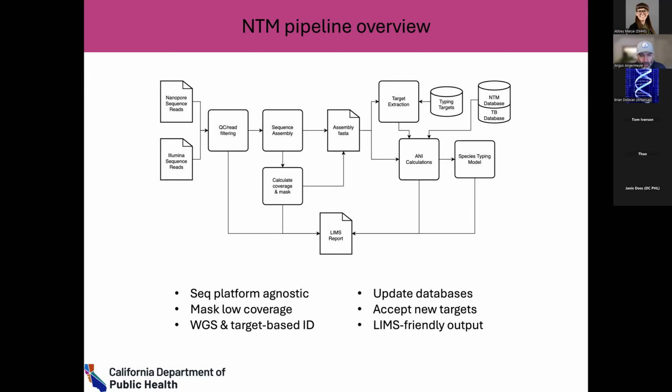And also, like I said before, different groups are doing some of their own sequencing. In our group, we pretty much do only Illumina. Some other groups, for cost saving measures, have their own ONT setups. And so we end up getting a ton of different data from different platforms, different chemistries, and different qualities. I'm trying to be as agnostic as possible to accept all of that and do the best we can.